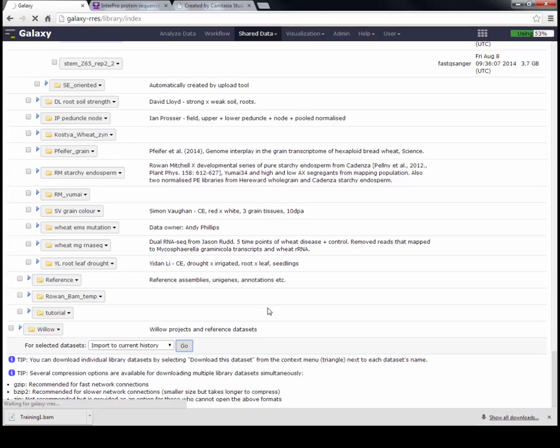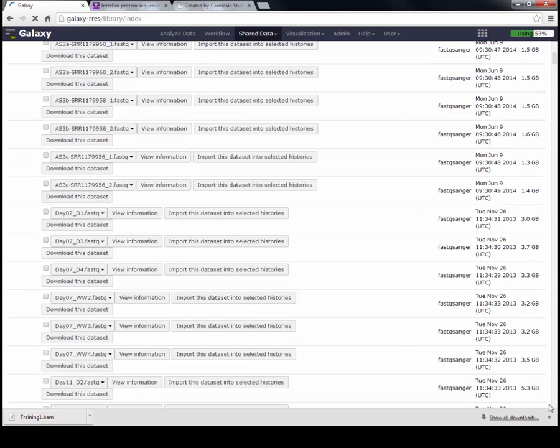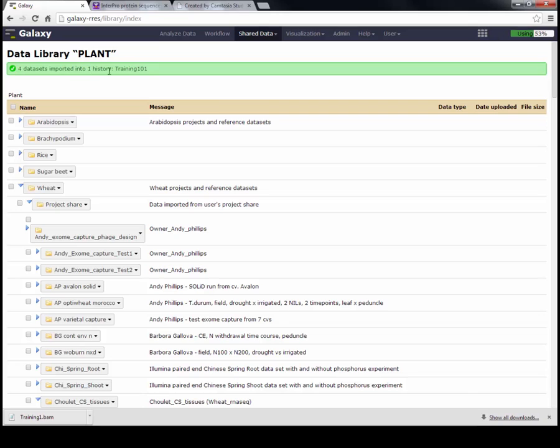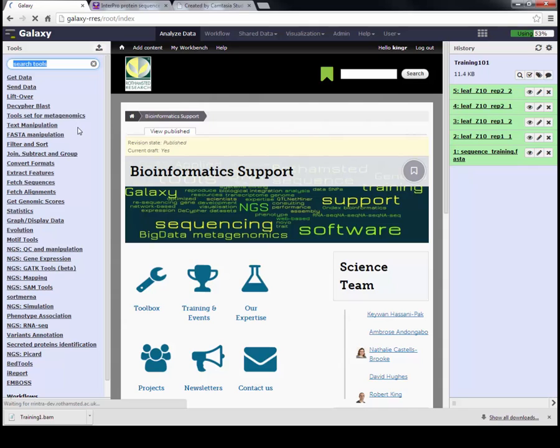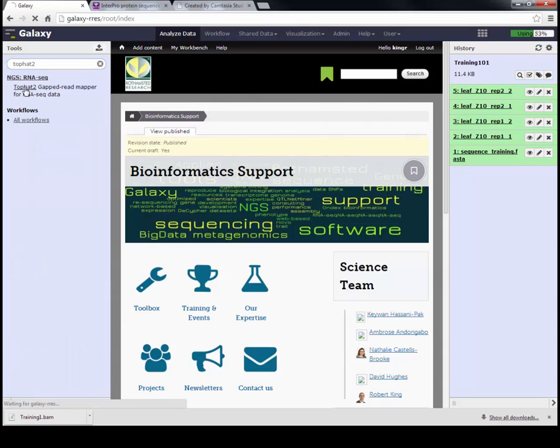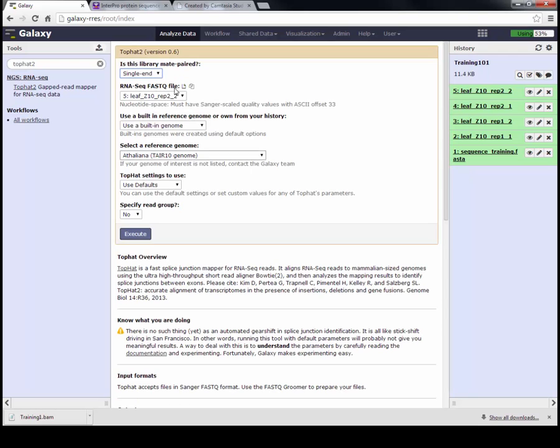The next thing we're going to do is map this RNA-seq data to our reference. We're going to use a mapper called TopHat2, which is specific for RNA-seq data, because it's needed to split the reads where there are exons and introns on the genomic DNA. Once that data has been imported, the browser will stop doing the spinning icon, and at the very top when it's finished, we will have four files imported to your current history - Training 101. Go to Analyze Data to go back. Type TopHat2 into the search bar and click on it.